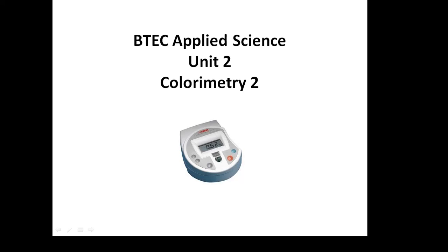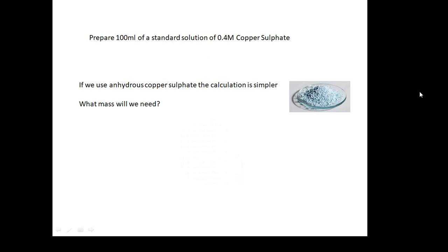BTEC Applied Science Unit 2, Colorimetry 2. This is my second video on the colorimetry task. Prepare 100 millilitres of a standard solution of 0.4 molar copper sulfate. Your teacher may ask you to prepare a bit more or less, perhaps a slightly different concentration. This is what I ask my students to do.